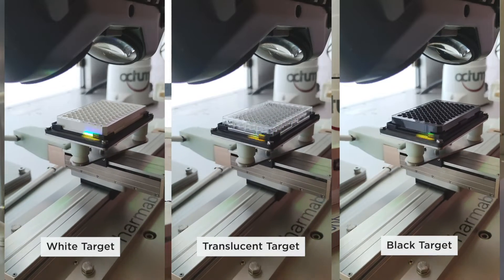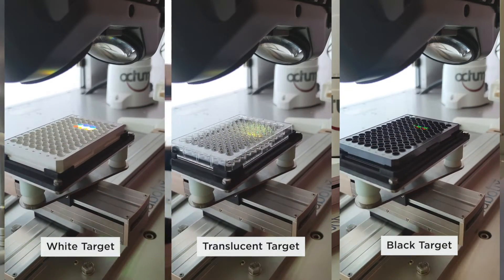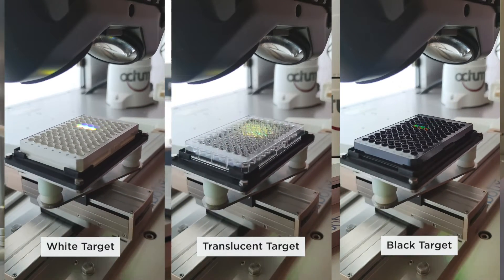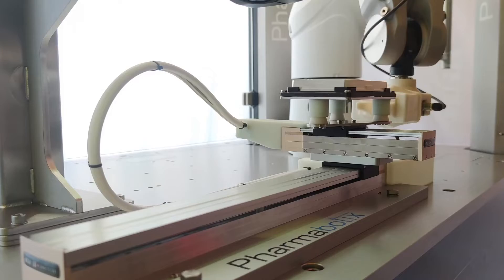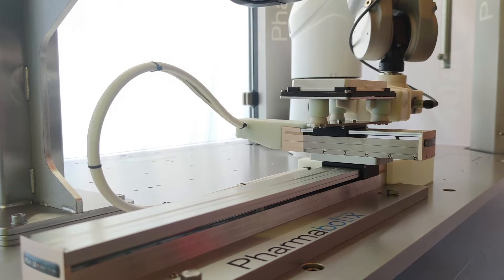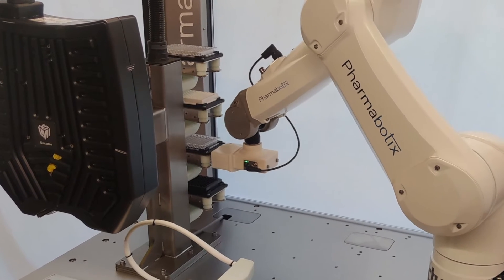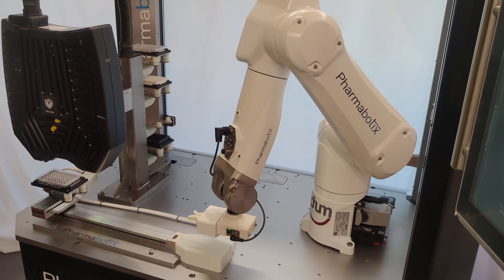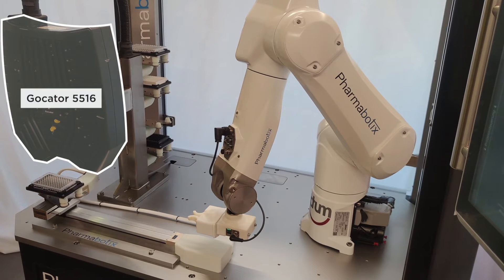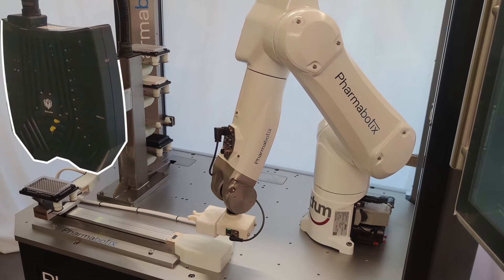The solution we are presenting is an actual use case we had with a customer of ours. Inspect micro test plates for flatness, length and width. The difficulty of it, he had different materials with different colors and also translucent materials. The challenge was to find a sensor which is capable of capturing 3D data of each of those surfaces.